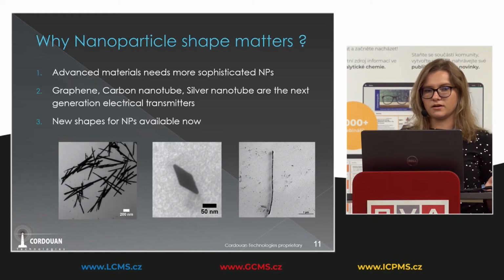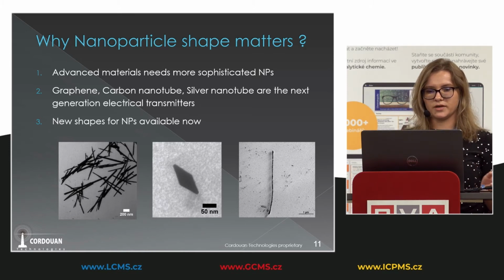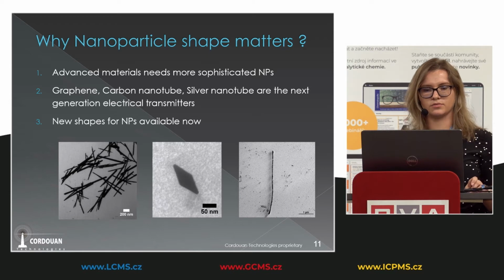But that was the case of spherical nanoparticles. With time, we know that in our suspensions, not really all particles are spheric.